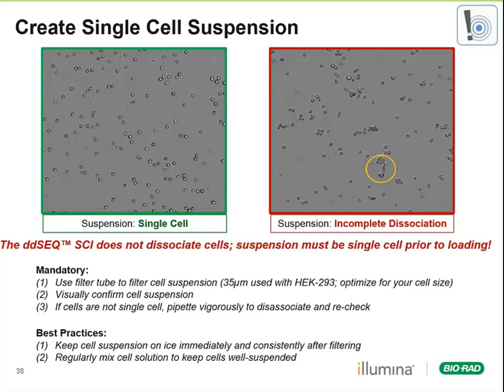Best practices here include, during passaging, keeping the cell suspension and reagents on ice, especially once you've filtered the cells. Also, we don't want to let the cells sit around too long. We want to keep mixing them and proceed with loading the ddSEQ SCI quite quickly.